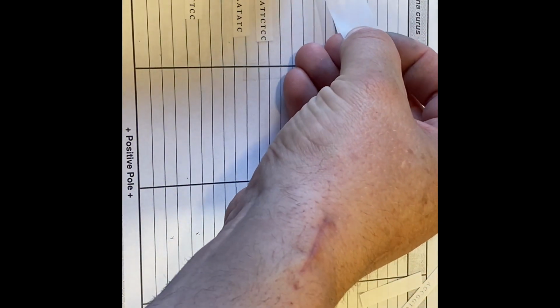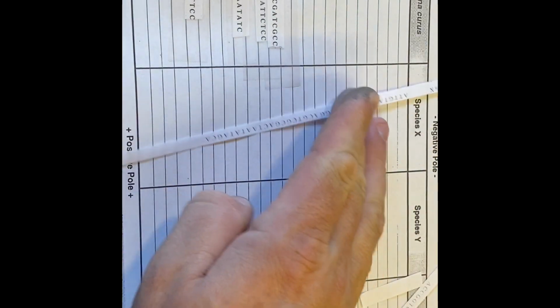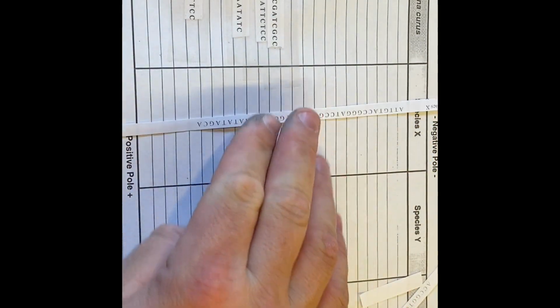11. And a little bit longer with some tape. And 12. Okay. So that is your first gel lane. Okay. You do the same for X and for Y and for Z.